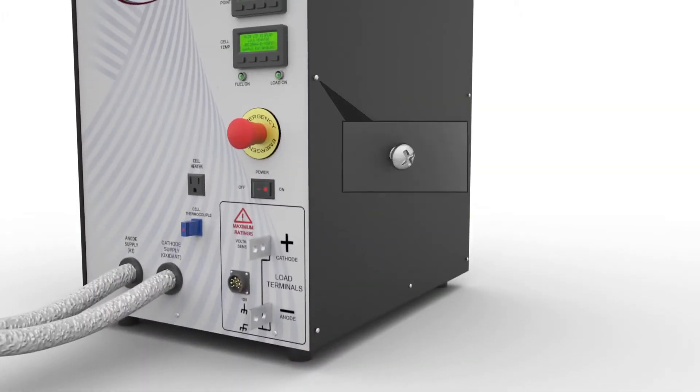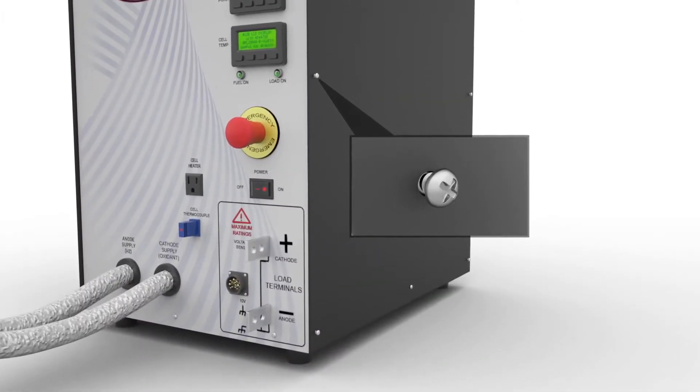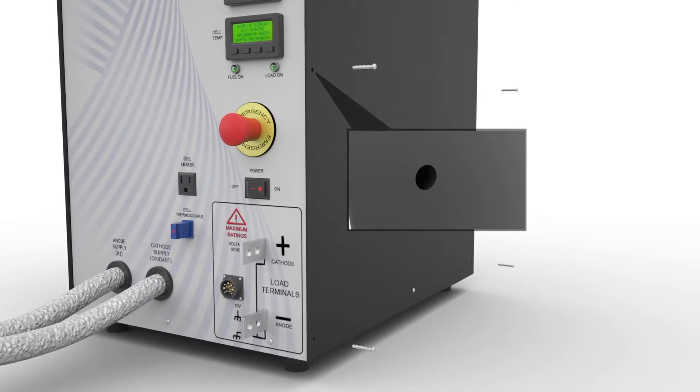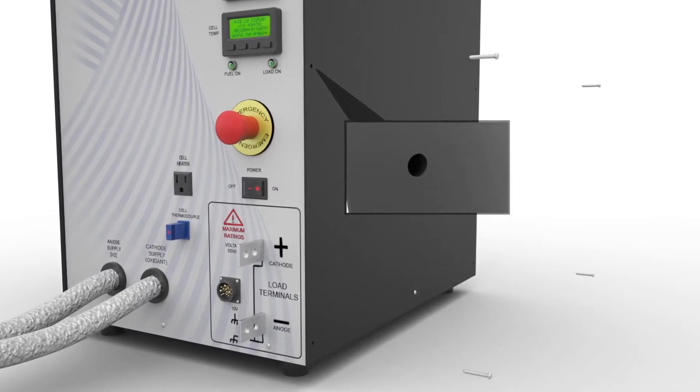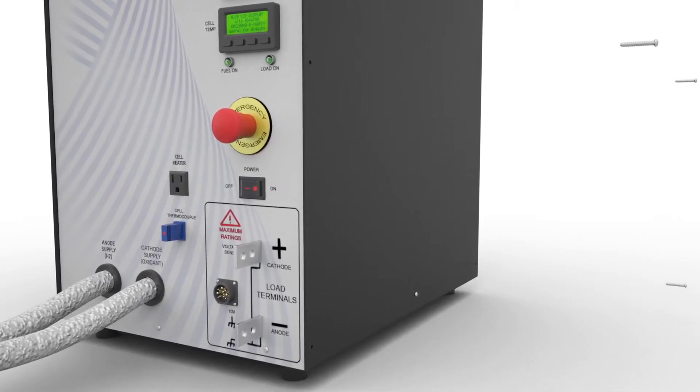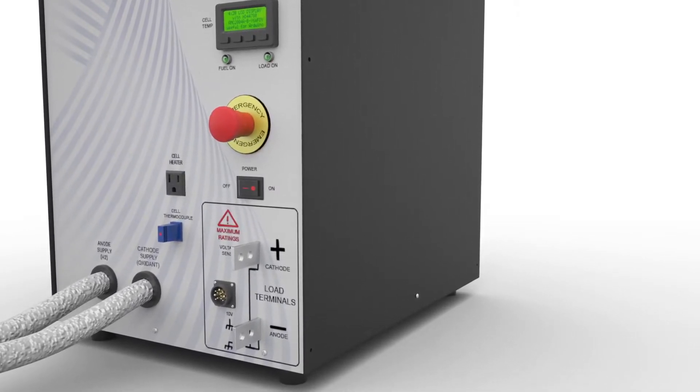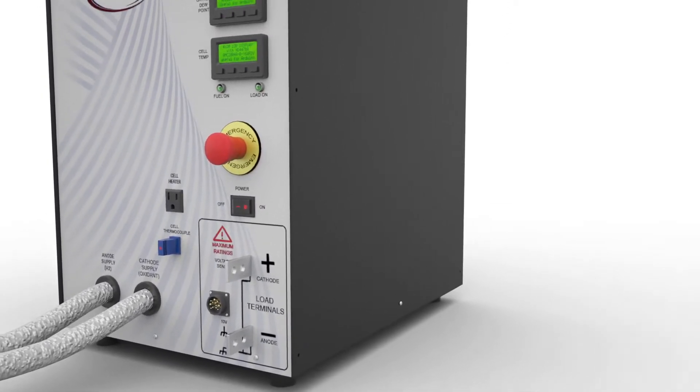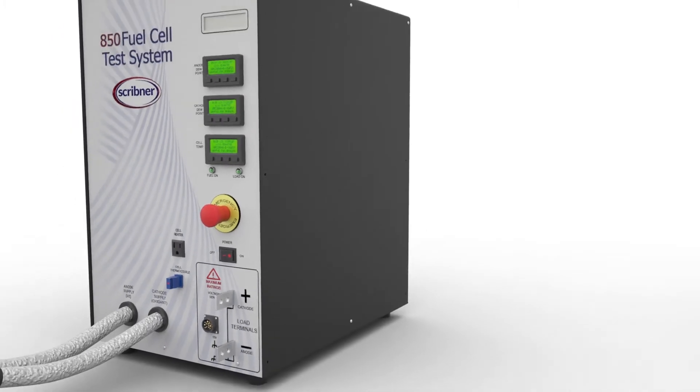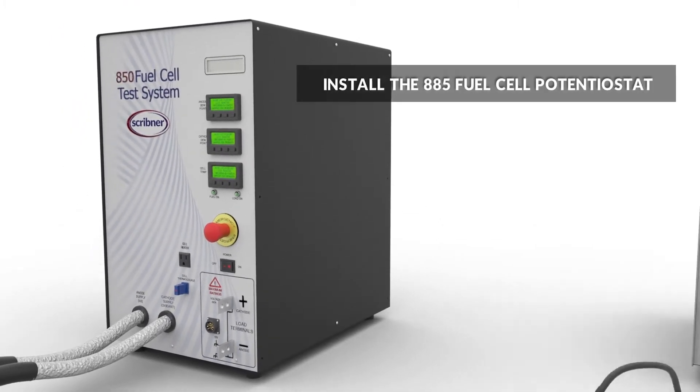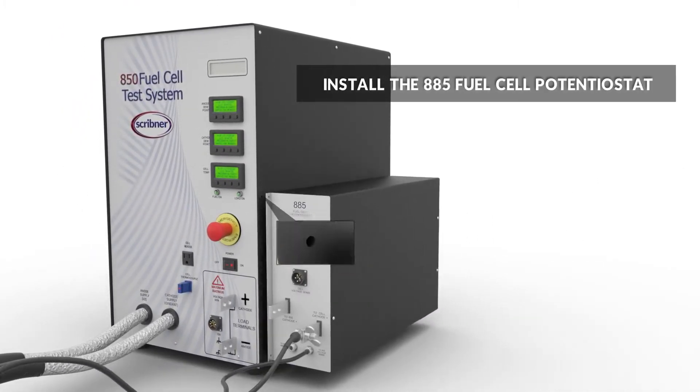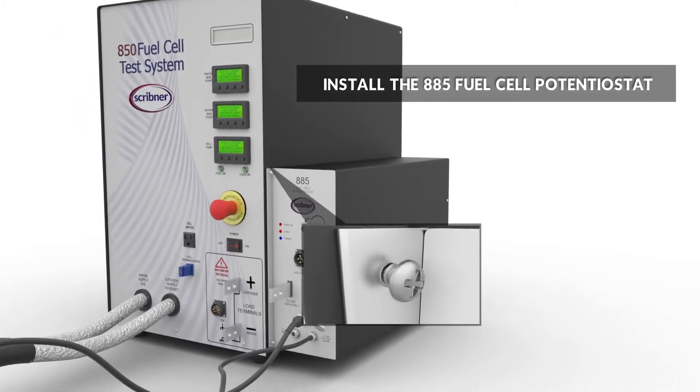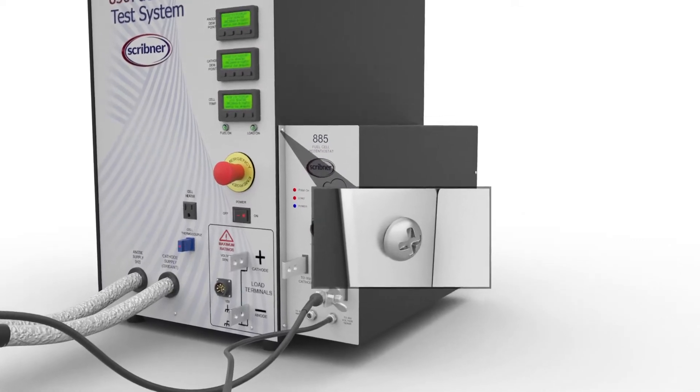To install the 885 fuel cell potentiostat for an 850 fuel cell test system, start by removing the four chassis cover screws on the side of the 850. Fasten the 885 potentiostat to the side of the 850 using the four chassis cover screws.